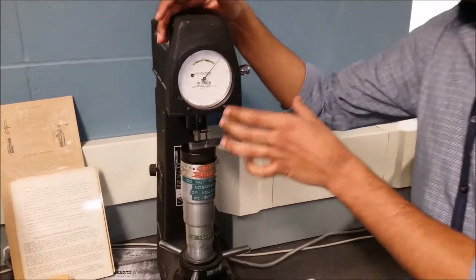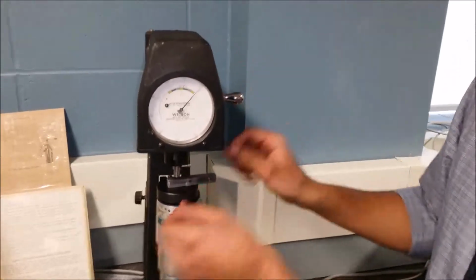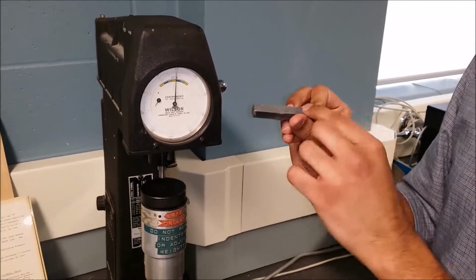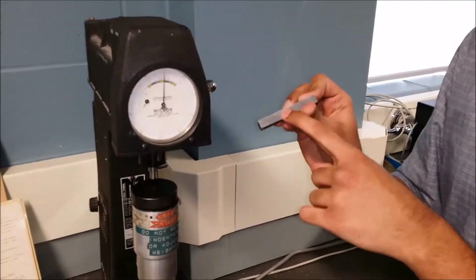And then if we do the same thing for the middle part, it's going to be harder at the fusion, because there are two materials, low carbon and high carbon, fusing together. So the material is going to be harder at the middle.